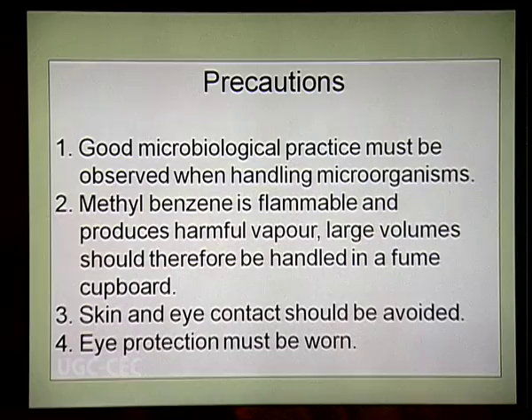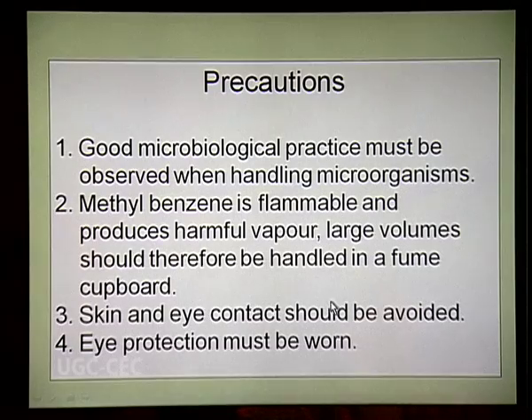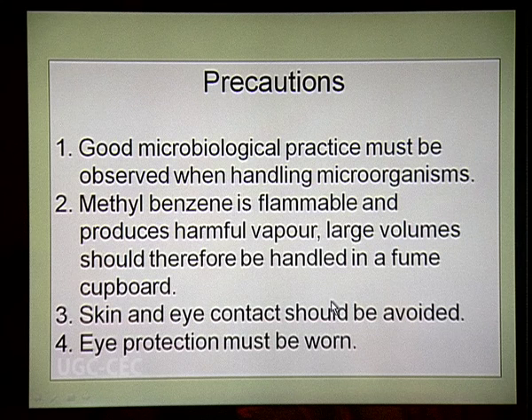While you are performing this experiment, certain precautions are to be taken. As you are performing a microbiological experiment, all microbiological safety measures and aseptic techniques are to be followed. Second important thing is, as methyl benzene is flammable and produces harmful vapors, you have to be very careful. If the amount of methyl benzene that you are using is too high, then it's better to use a fume chamber. Skin and eye contact should be avoided. If necessary, we can use specs to protect our eyes.